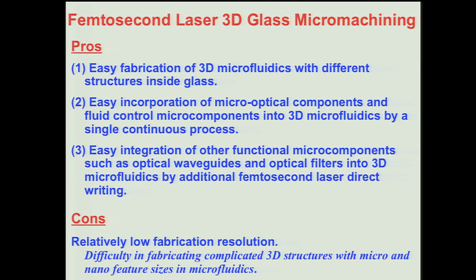That's our technique of the femtosecond laser three-dimensional glass micromachining. It is a very attractive and powerful tool for fabrication of the functional biomicrochips because this technique has some advantages over the conventional fabrication methods of the biochip. Namely, easy fabrication of the three-dimensional microfluidics with different structures inside the glass without the very complicated procedure of the stacking and the bonding of the glass substrates.